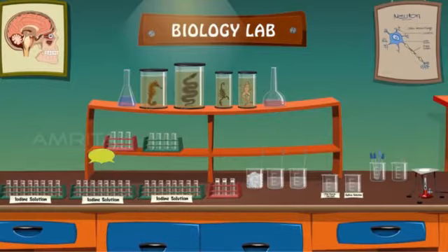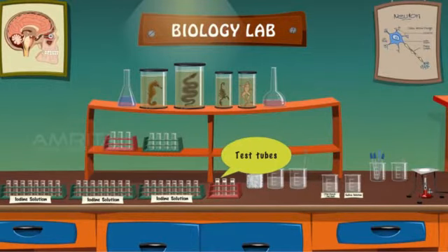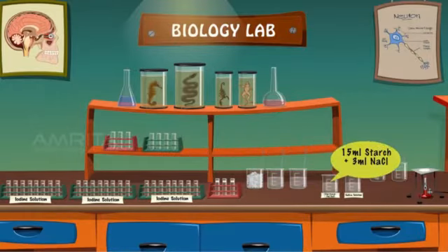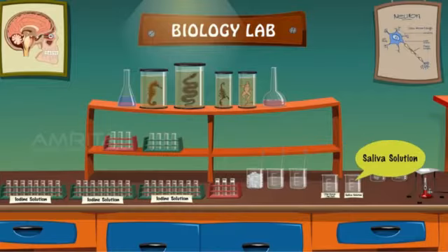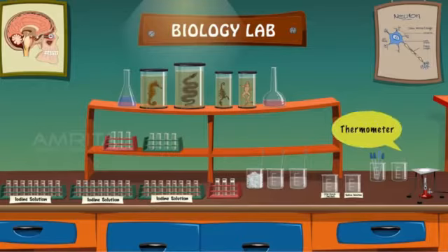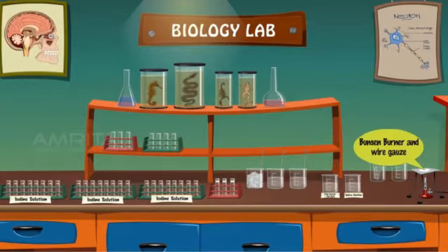3 series of test tubes having iodine solution in each, test tubes, ice cubes, water, 15 ml 1% starch solution plus 3 ml 1% NaCl, saliva solution, droppers, thermometer, Bunsen burner and wire gauze.